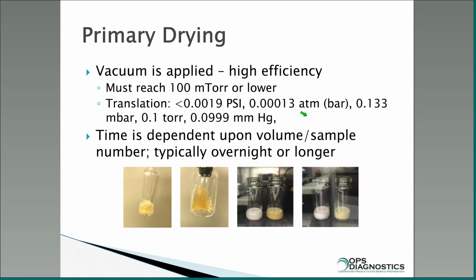And once you're there, you have to let it go for, depending on your sample, usually at a minimum overnight. Especially if you have a lot of samples hooked up to one freeze dryer. So the time is going to be dependent on the volume and the sample number, but overnight is not uncommon. If you have a large volume and let's say a shelf dryer, you can go several days.